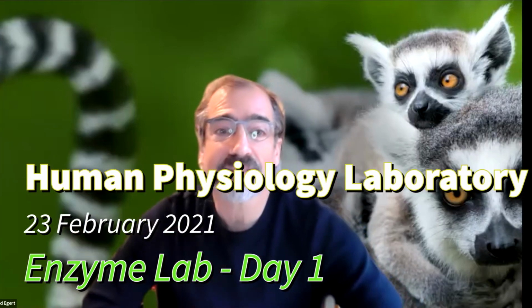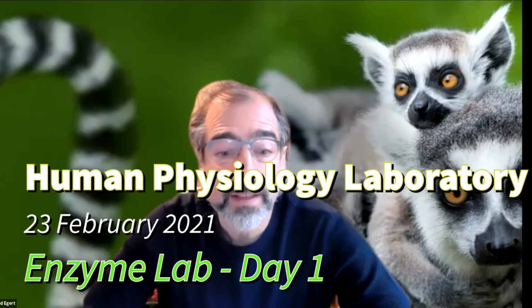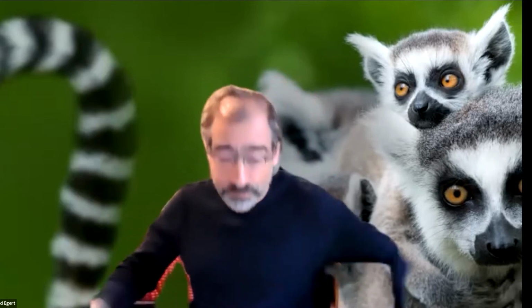Okay, so the Enzyme Lab. The Enzyme Lab is one of the labs that I think is really interesting, but it also tends to confuse people for a number of reasons. Partly there's just the theoretical underpinnings of it, but then there's also just the mechanics of how we're actually measuring things and how we're actually getting the values for our variables.